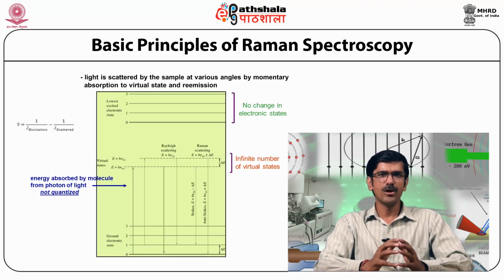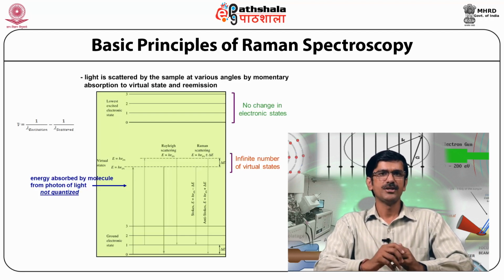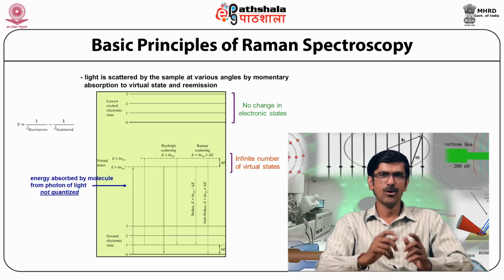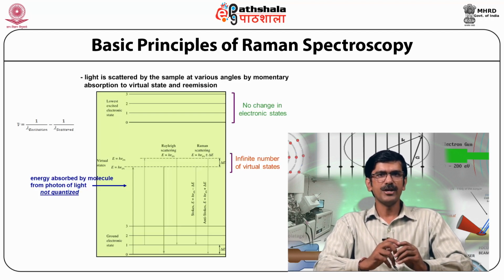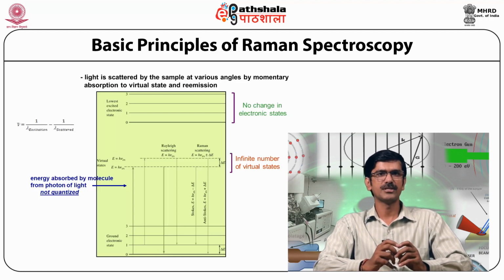A small portion of the molecules are in vibrationally excited states. Raman scattering from vibrationally excited molecules leaves the molecule in the ground state. The scattered photons appear at higher energy, which is shown in figure 1. The anti-Stokes shifted Raman spectrum is always weaker in intensity than the Stokes shifted spectrum. While at room temperature, it is strong enough to be useful for vibrational frequencies.